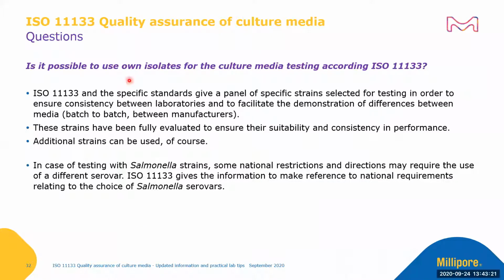Is it possible to use own isolates for the culture media testing according to ISO 11133? ISO 11133 and the specific standards give a panel of specific defined strains selected for testing in order to ensure consistency between laboratories and to facilitate the demonstration of differences between media, batch to batch variations, between manufacturers.